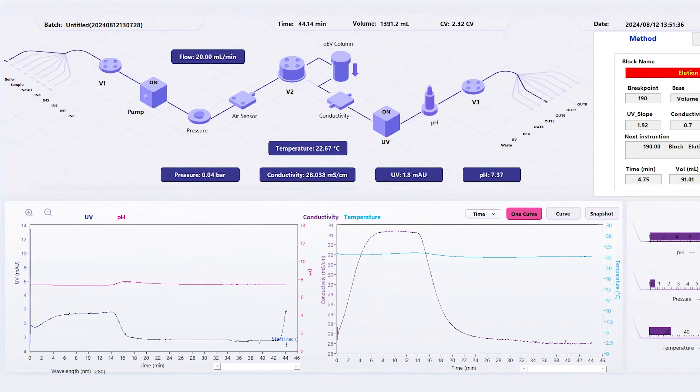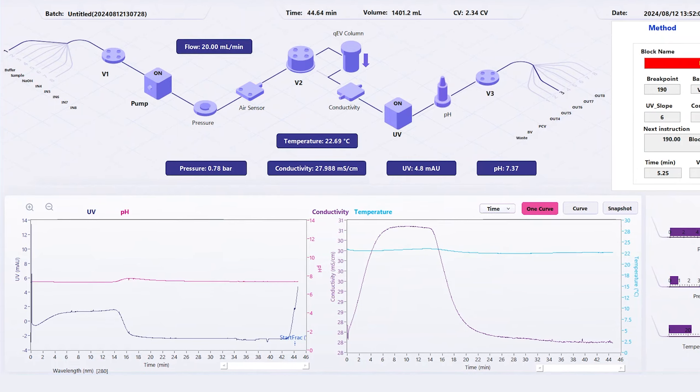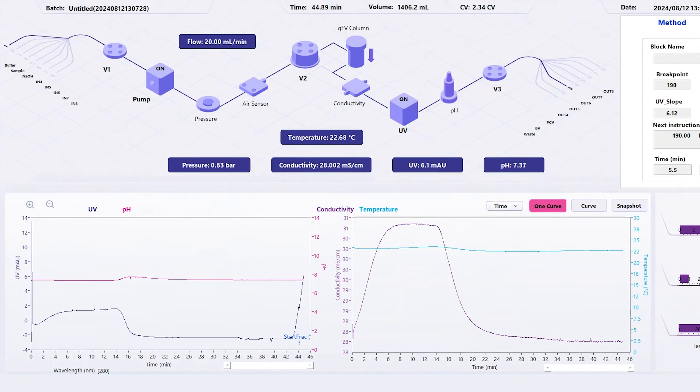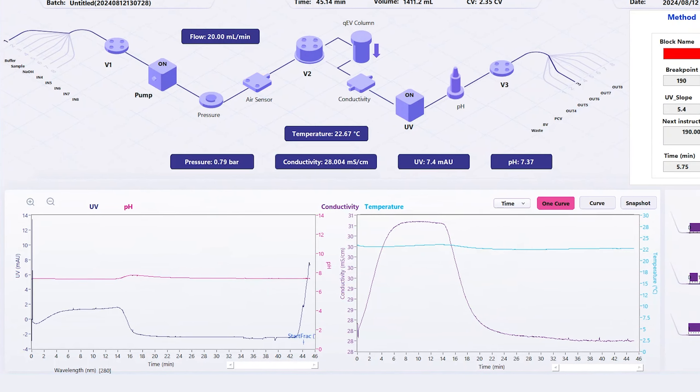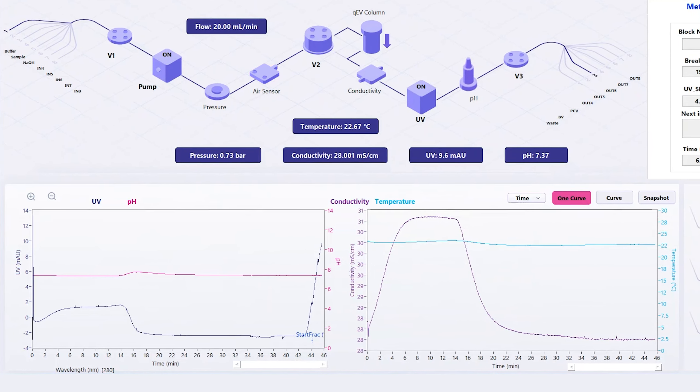You can use this UV trace to check that your sample is eluting as expected, and to identify any issues early on.